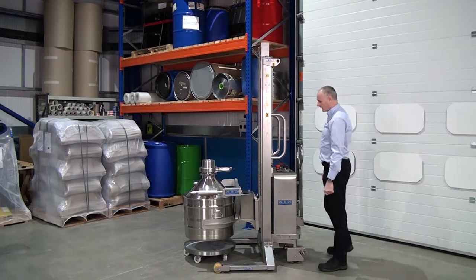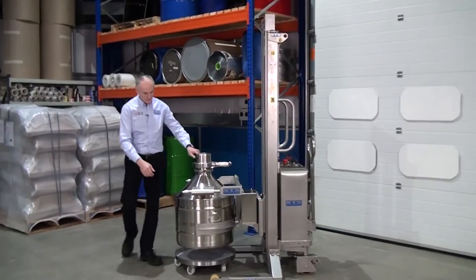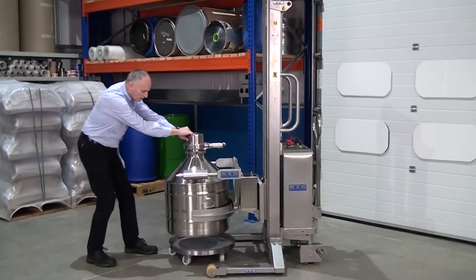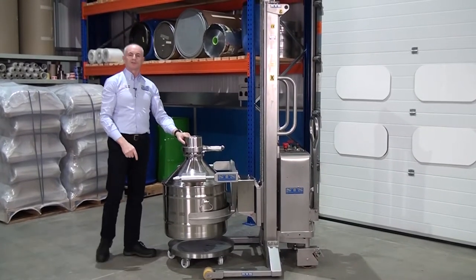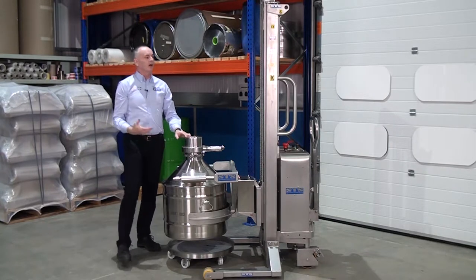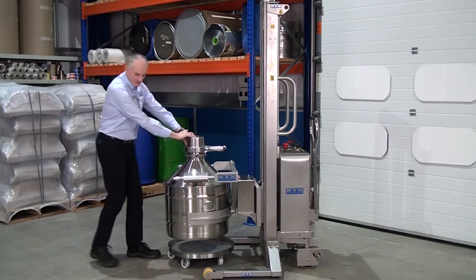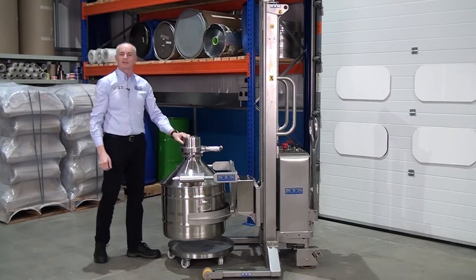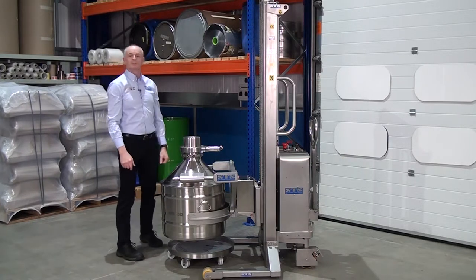If I put the brakes on here — this drum has got 150 kilos of weight in it, so this is over and above the weight we need, but we're rated at 150 kilos. You can see here you cannot get the unit to slide off the end. So it's very simple and easy to operate.